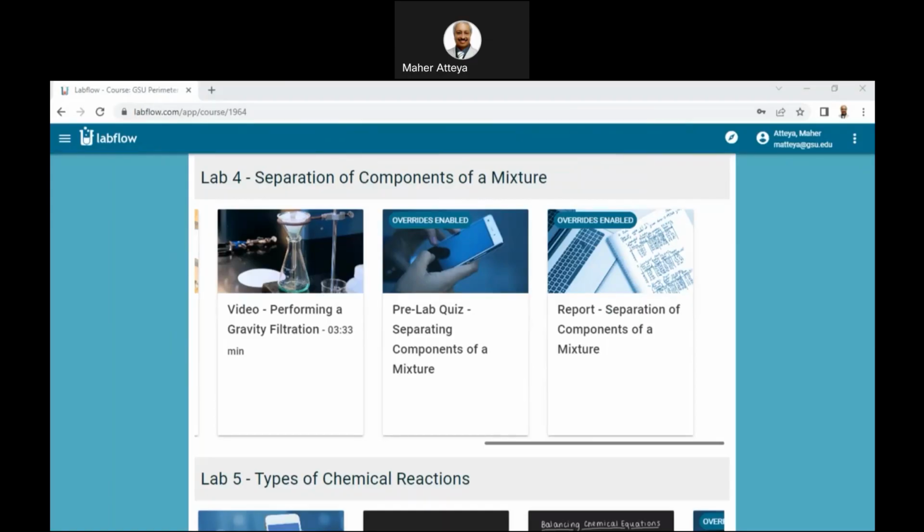So, okay, you have two items that you have to follow, and the videos you can read. Those videos you can listen to, and you can look at the whole thing.